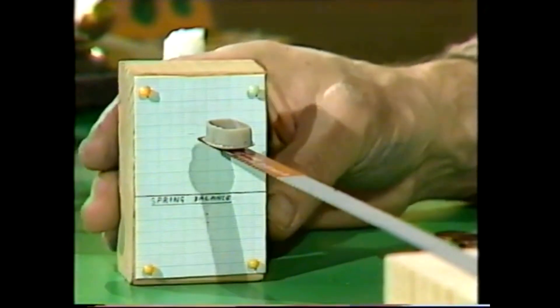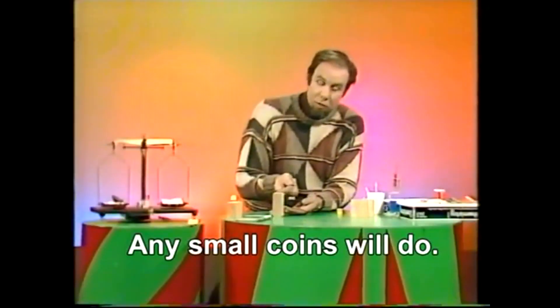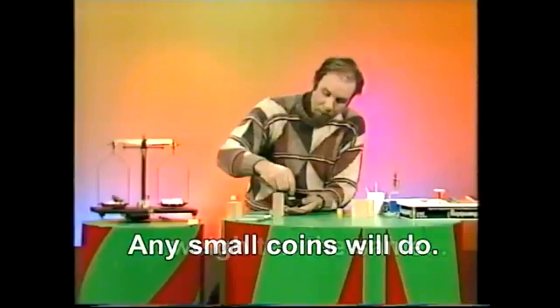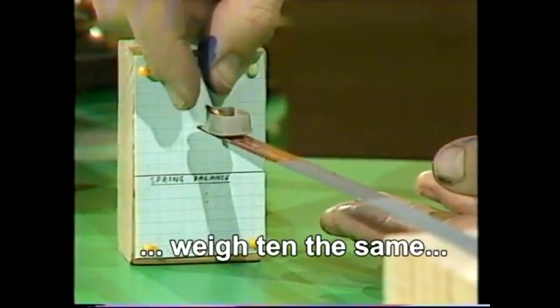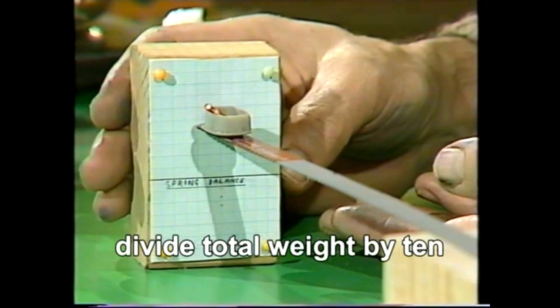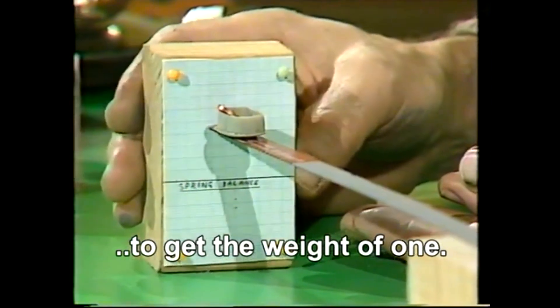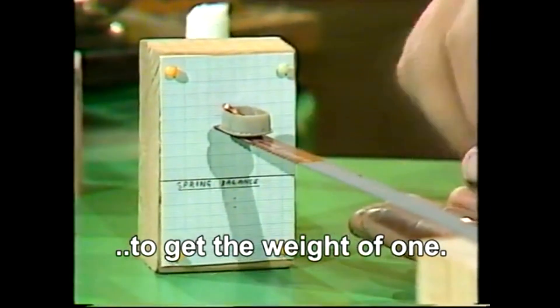Now we calibrate it with weights, and the easiest things, I think, are one-cent pieces, because each of those is roughly two and a half grams. Put one in the pan, the scale goes down, and when it stops jiggling we put it up to the graph paper and make another mark. That's the two-and-a-half mark. There we are — very faint, but it's just there.